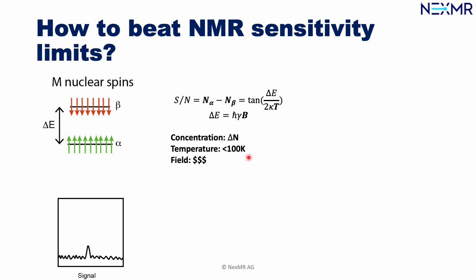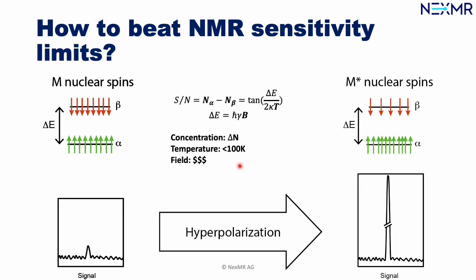And this means that this is also quite a big investment, so not every lab has the chance to buy such an expensive magnet. And this does not really increase your sensitivity. This is much more for resolution. So we use other tricks.